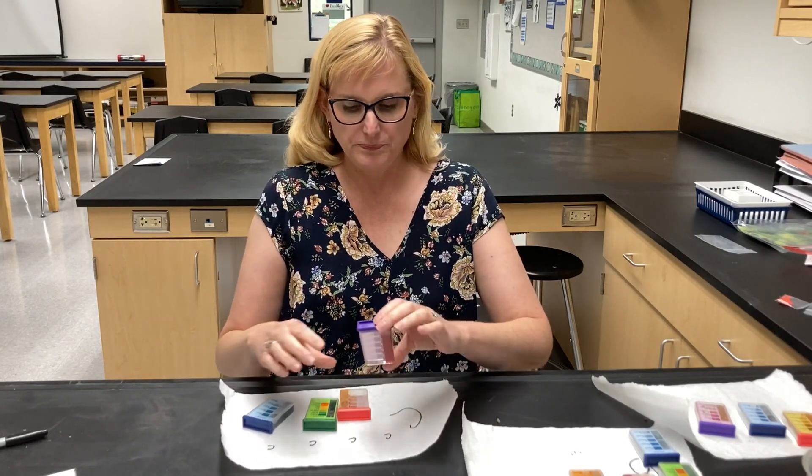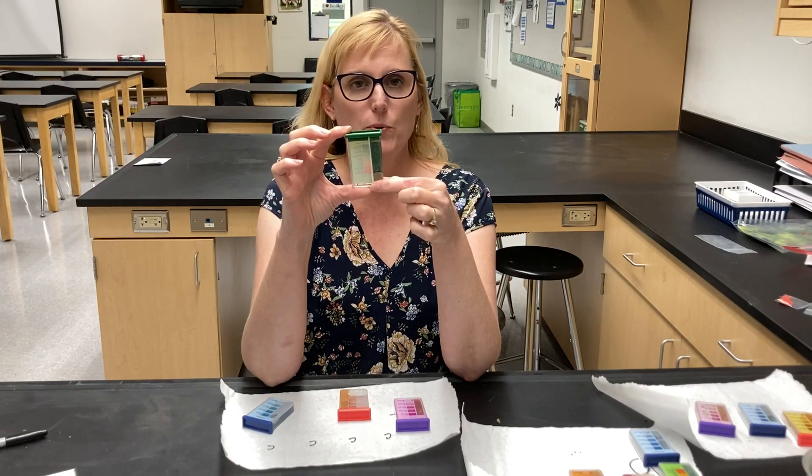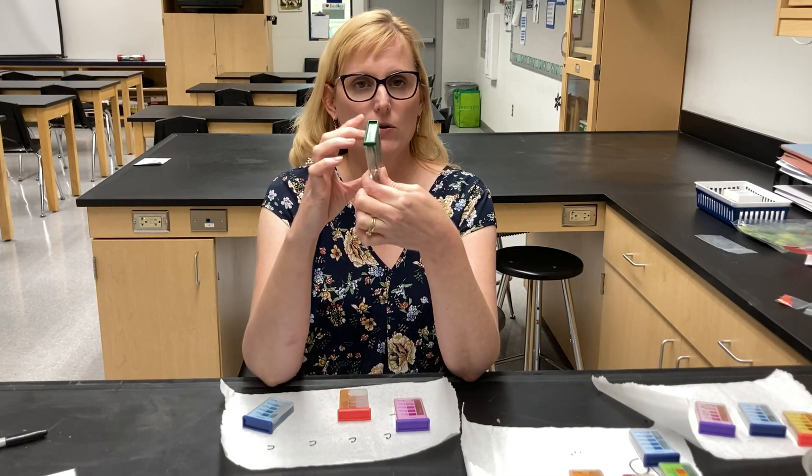Sample C — we'll start with pH. Now this is the darkest of the pH samples. It is 7.5, so it is slightly alkaline soil.